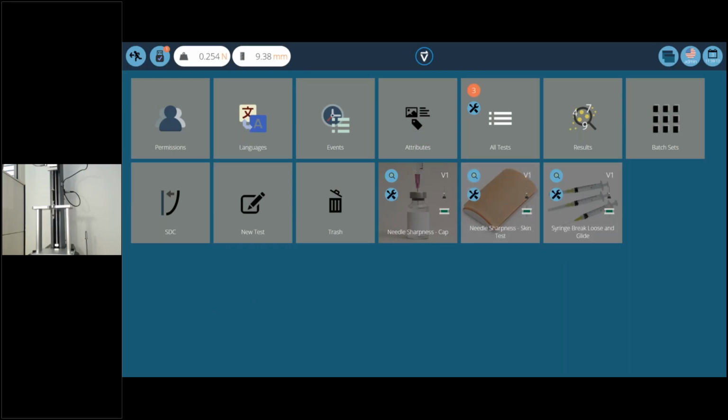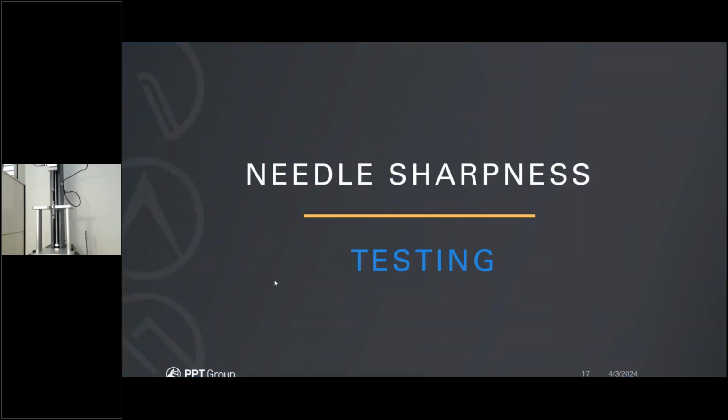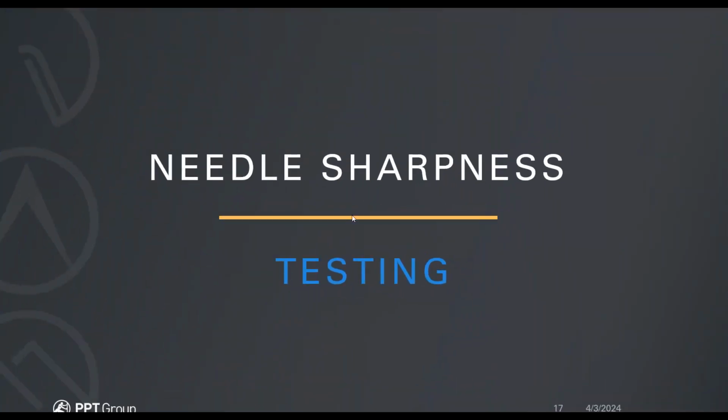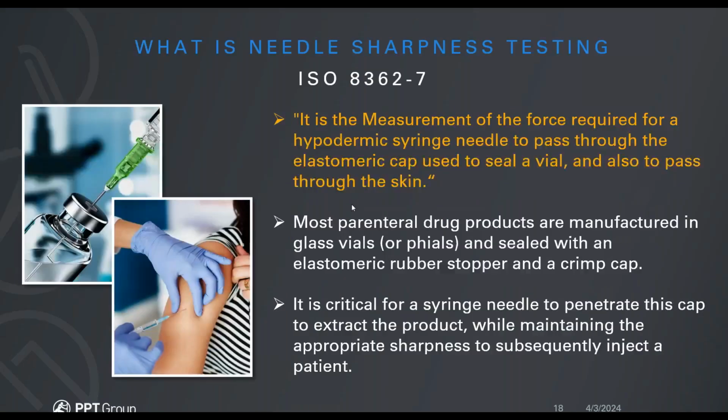Now, I'm going to go over to the syringe needle sharpness testing, and we'll come back here momentarily to the live demo. So needle sharpness testing, again, this is going to be in adherence to ISO 8362. It is simply the measurement of the force required for a hypodermic syringe needle to pass through the elastomer cap used to seal a vial and also to pass through the skin.